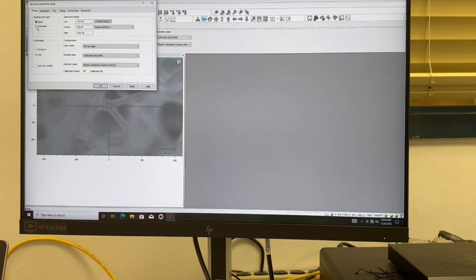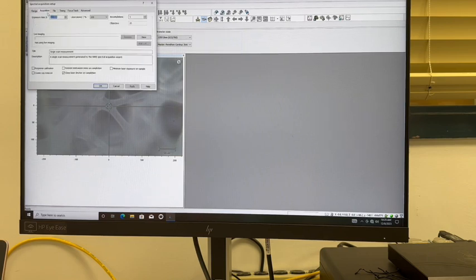Go to Measurement, New Spectral Acquisition, and choose if you would like a static or extended scan. An extended scan will run for 10 seconds and go over the entire Raman shift wavelength. The static scan will go over a specific portion of that spectrum range. You can change the center, which will automatically adjust the lower and upper bounds of that range. For the purposes of this sample, we will be doing an extended scan.